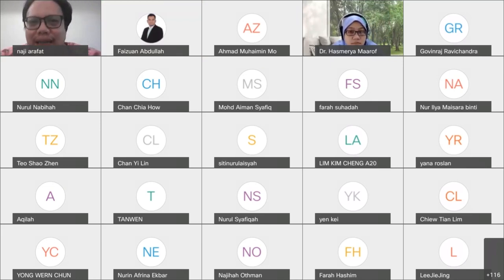So now why are we looking at nickel? Simple reason, because nickel is present in many anthropogenic exposure kind of contamination to the water. It can come from soil, it can come from pipings and all. So the high concentration of nickel would indicate anthropogenic exposure, or there is something wrong with your piping that you need to rectify. If you are the engineer and now you have a lot of nickel, you know that there must be something wrong with your piping and you can do intervention. So that is the reason why we need to quantitatively determine nickel in water.